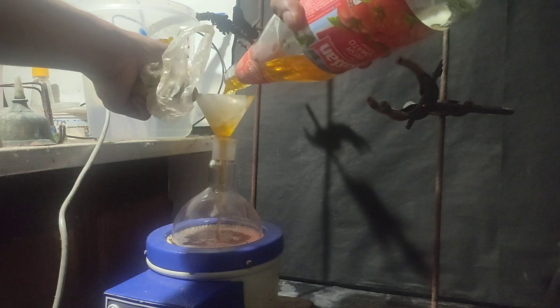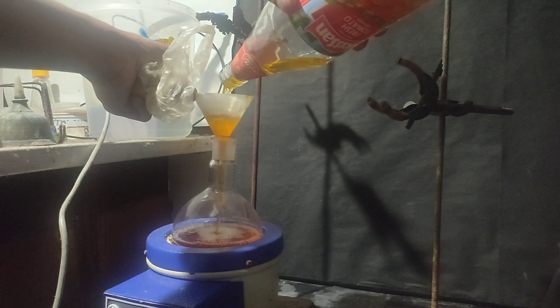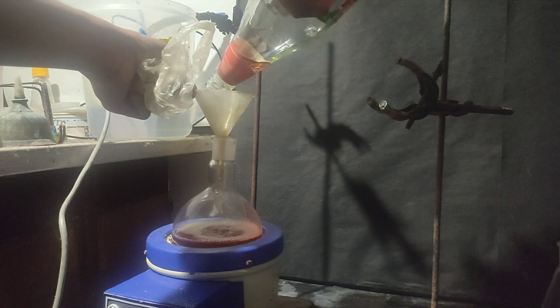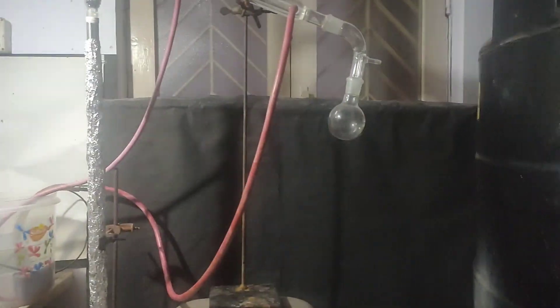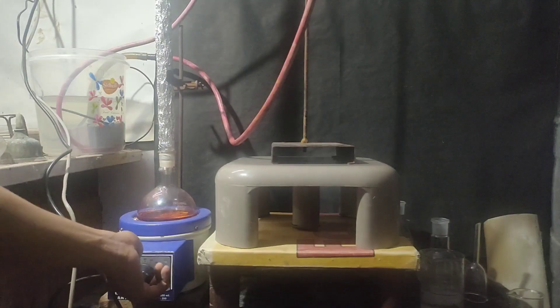So I pour 250 ml petrol in a round bottom flask and set it on fractional distillation using my DIY fractionating column. I have already uploaded a video on it.